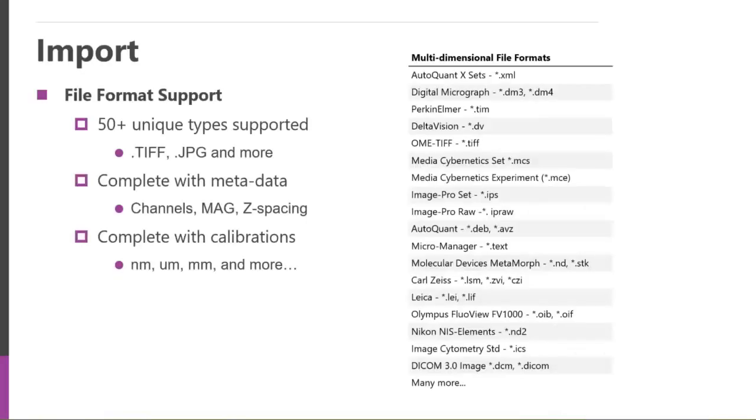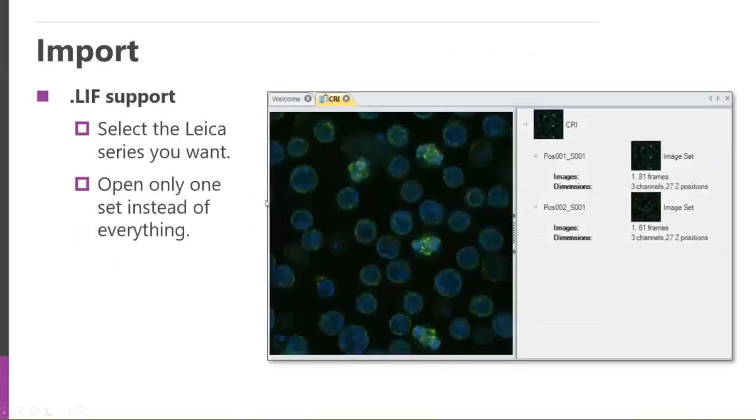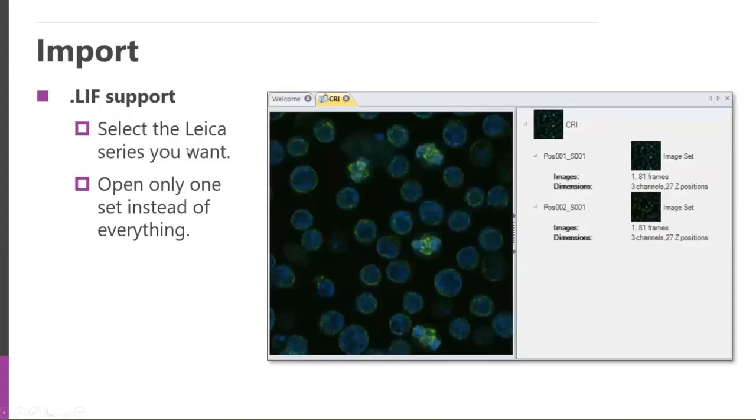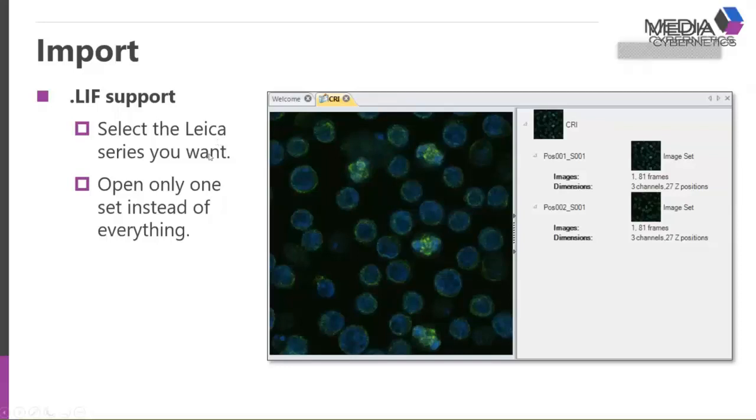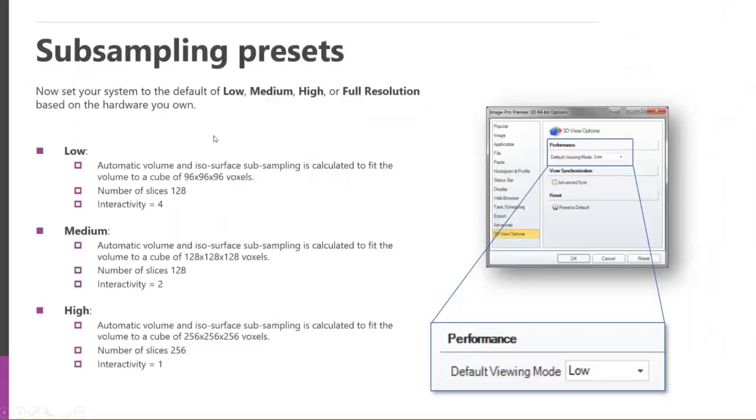First, we have a lot of file formats that are available, 50 plus that are available, including the microscope proprietary formats that they have. We read those right in, and we extract out all the channels, magnification times, Z-spacing, calibrations, and all that, which is really nice. Some of the file formats are brought in as an import, and specifically this LIF file format is kind of nice, in that if you have several image sets within it, you can just extract just that image set that you're interested in looking at.